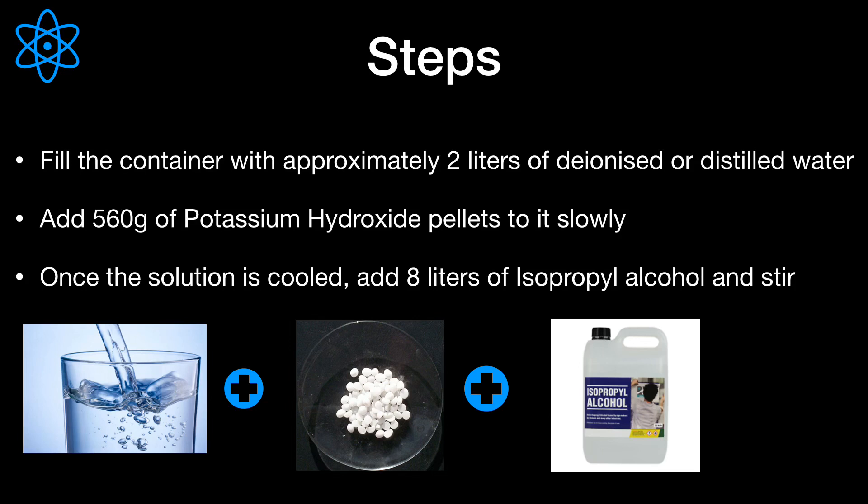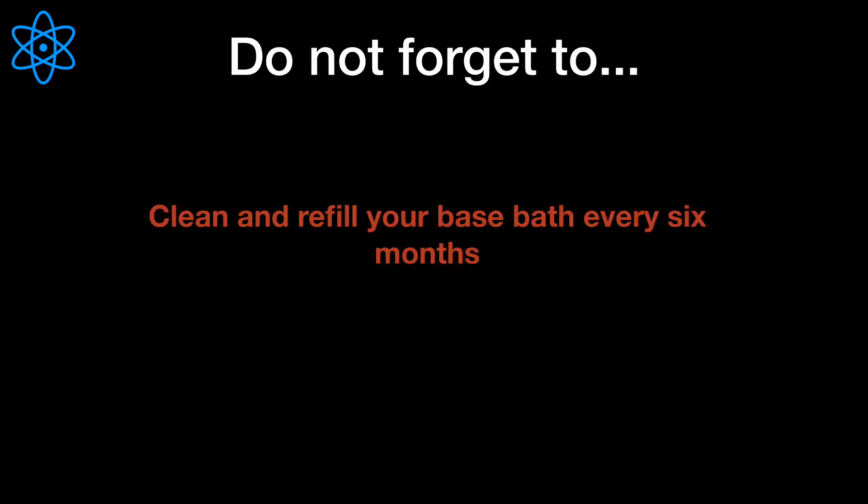Once the solution has cooled, add 8 liters of isopropyl alcohol and stir. Now your base bath is ready to use. Last but not least, do not forget to clean and refill your base bath once every six months, when the liquid becomes opaque in color, or when you have noticed a decrease in the efficacy of the base bath.